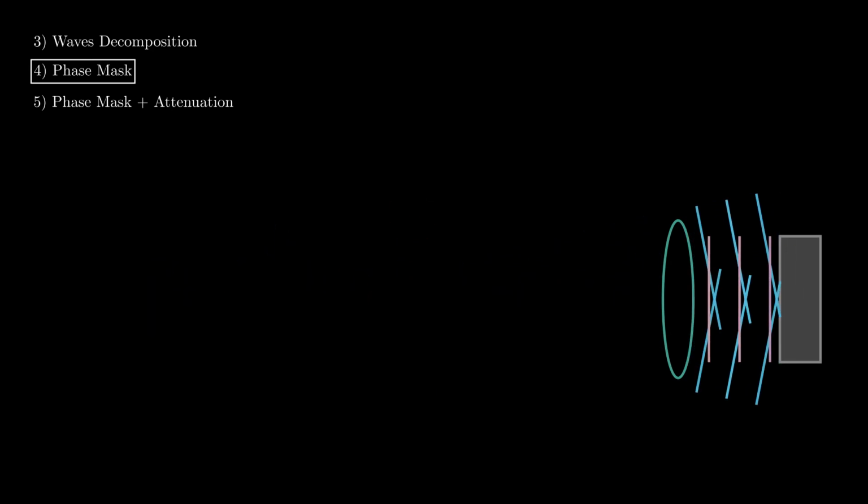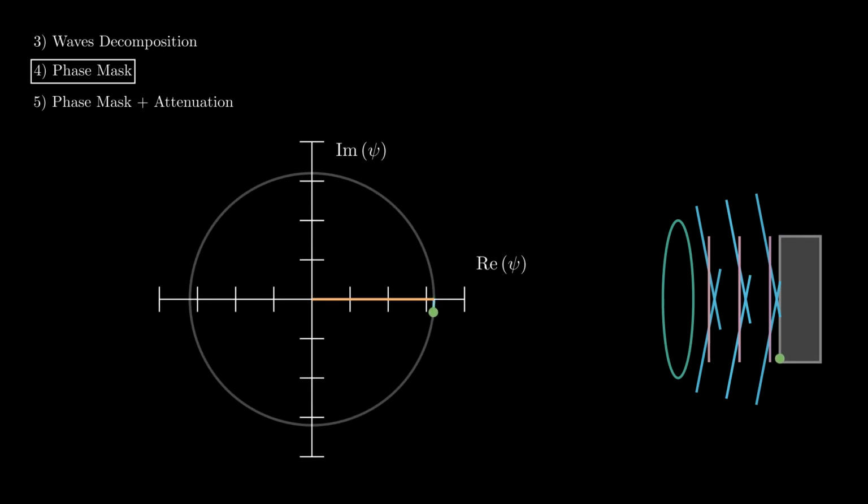Let's see how introducing the laser solves the problem. Recall how the amplitude behaved on the camera before introducing the laser. It was just rotating in the complex plane, right? Well, now, since the laser induced a phase shift to the unperturbed component, only it rotates in the complex plane. Specifically, we choose the intensity of the laser such that the rotation is exactly half pi.